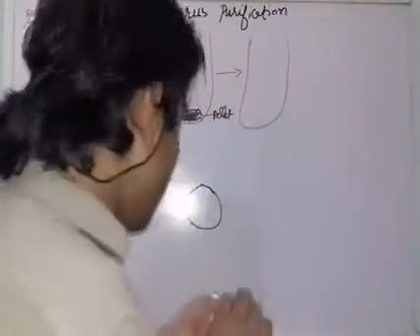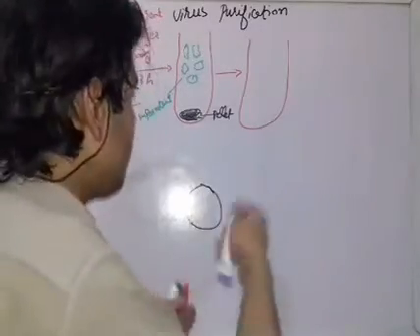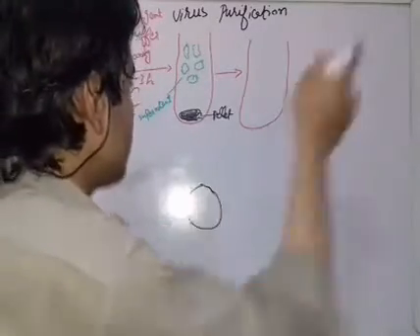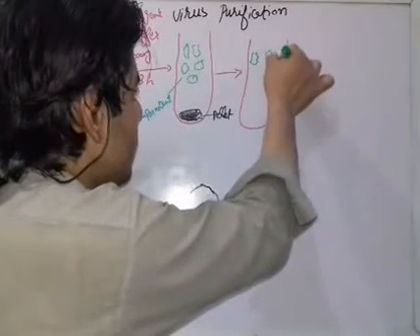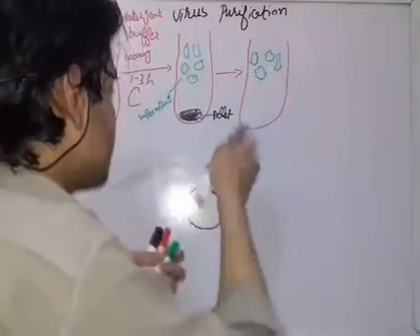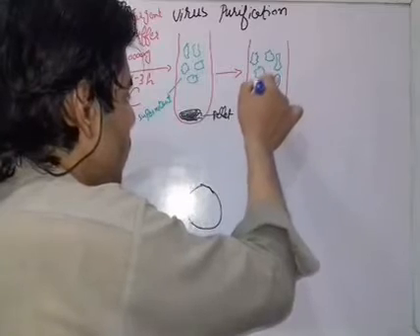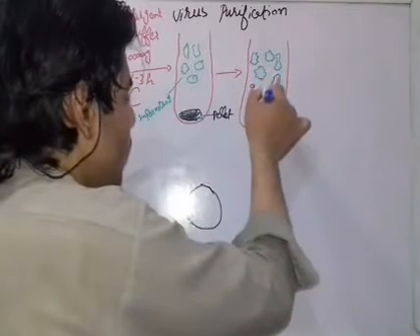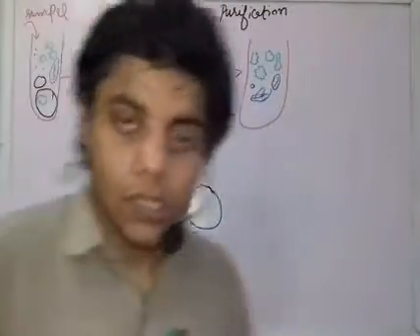So we get the pellet, and now we resuspend the pellet, and again we get the active viruses. Let's suppose this time these green viruses represent the active viruses, and other cell content are also present: mitochondria, ribosomes, or Golgi bodies. Fine. Some other cell content are also present.